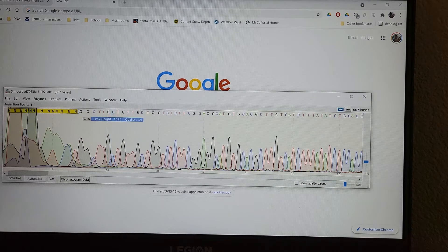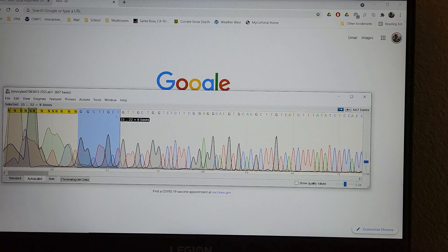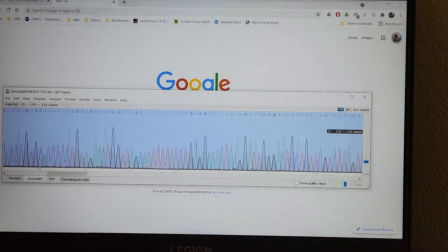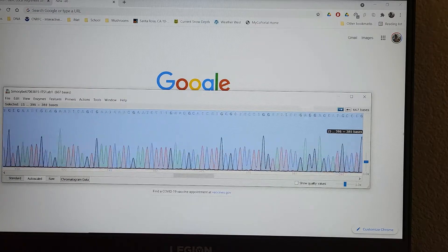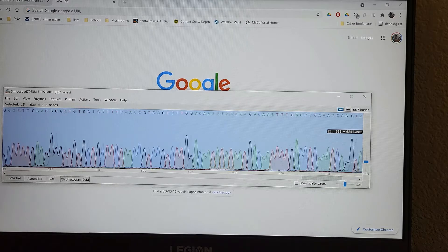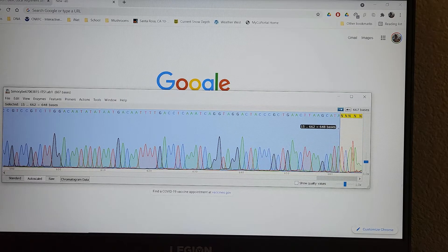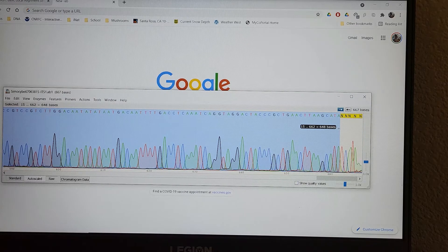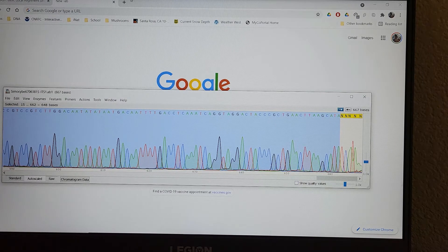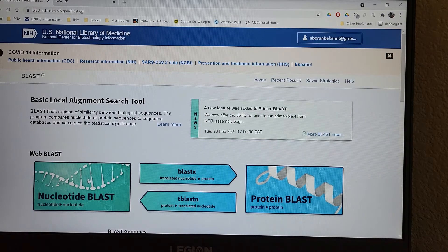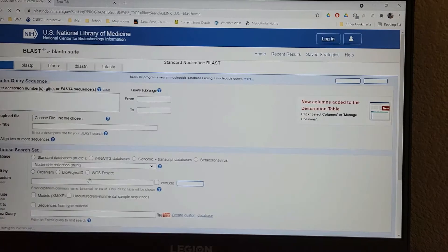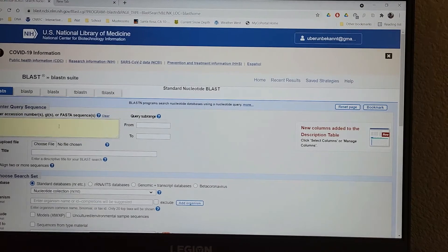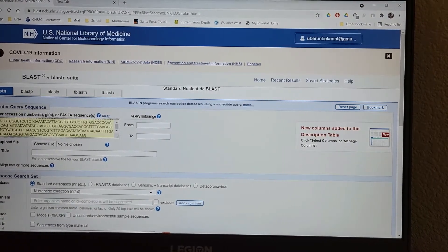I'm going to just select from the first base pair that it calls correctly and highlight the whole thing. Cut it off right there. Copy. And then I'm going to go to BLAST. Click nucleotide BLAST right here. I'm going to go into this box.